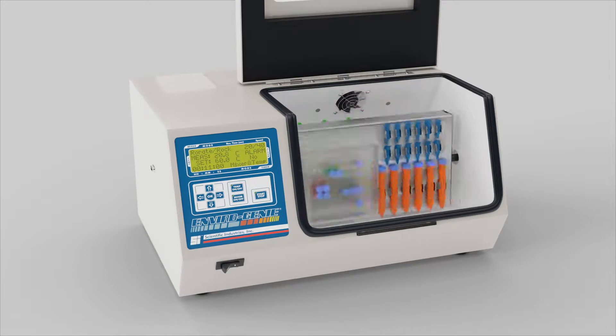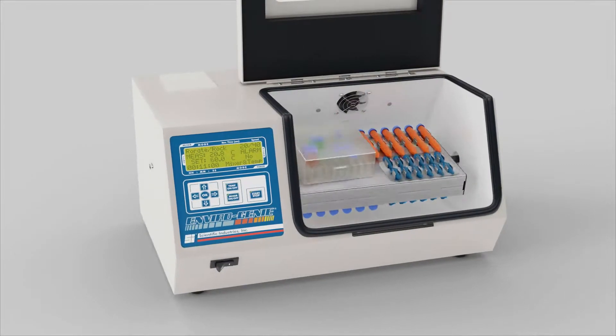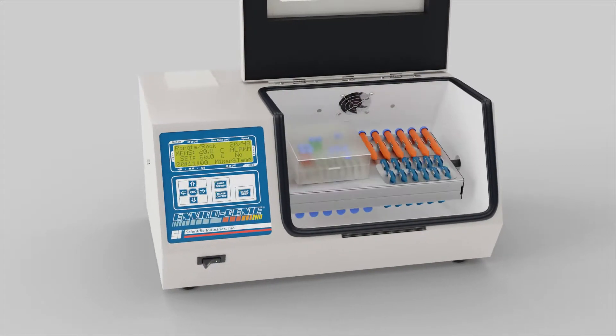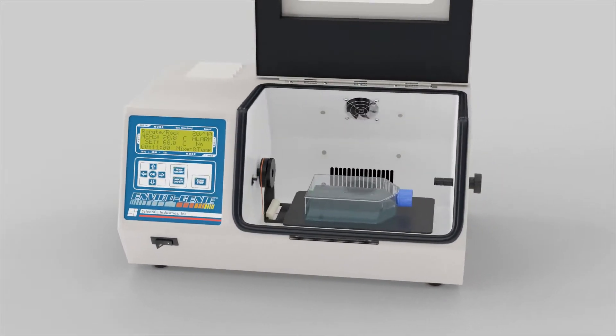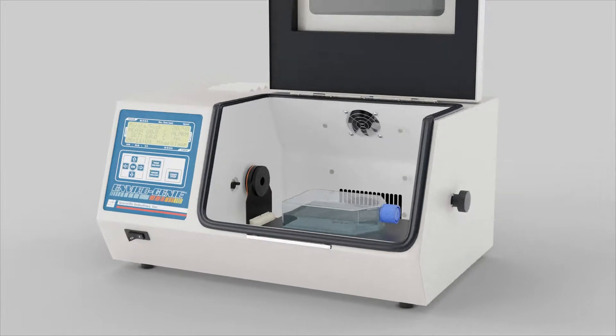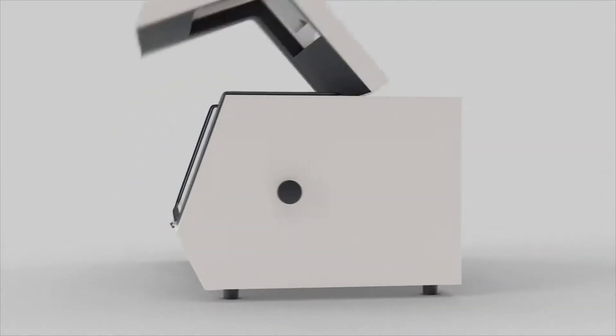Versatility and precision with 360 rotating, rocking and shaking, all in one compact design.